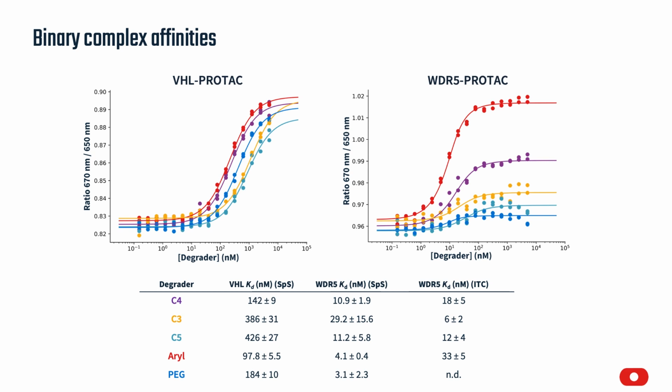But this should not be interpreted as insufficient binding. Rather, this gives us some indication that spectral shift not only provides biophysical data in the form of KDs, but also a hint at the fact that there may be structural differences between the degrader WDR5 complexes.